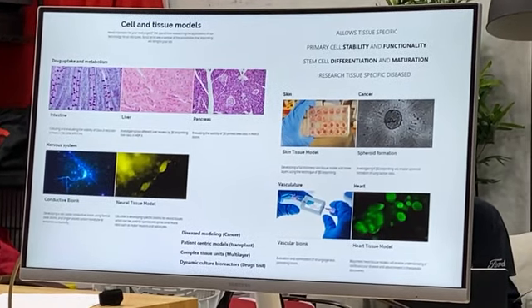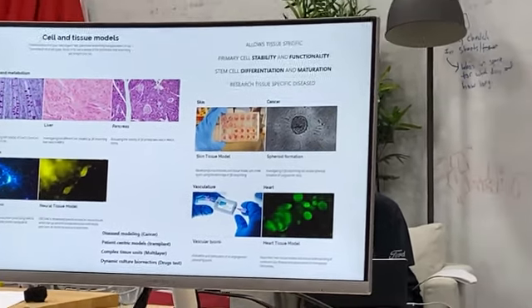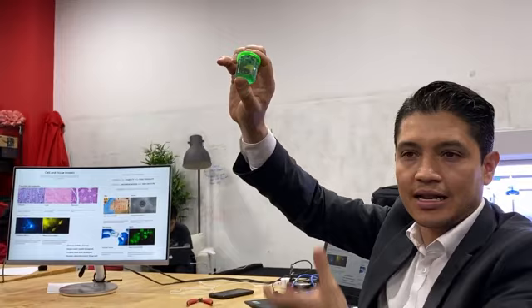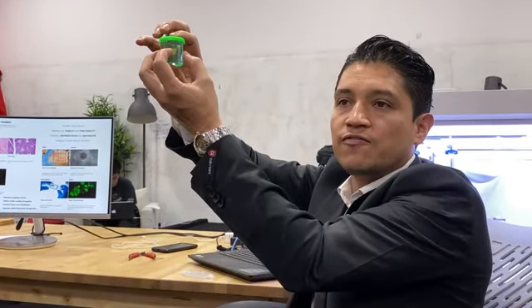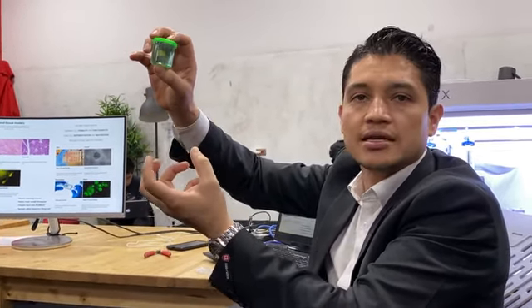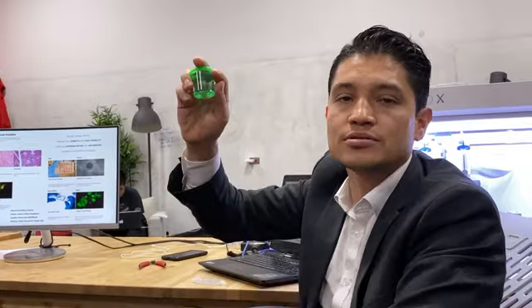So I don't know if you have seen on the news, or heard, about a beating heart, right? It was something like this inside of a gel. That is the FRESH printing approach. So you can print inside of a material that serves like a structure, like a support material. You can print that and make it work, right?